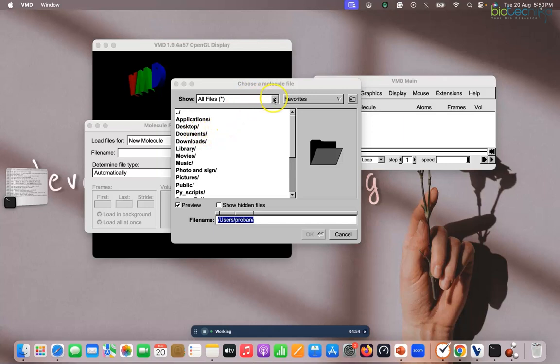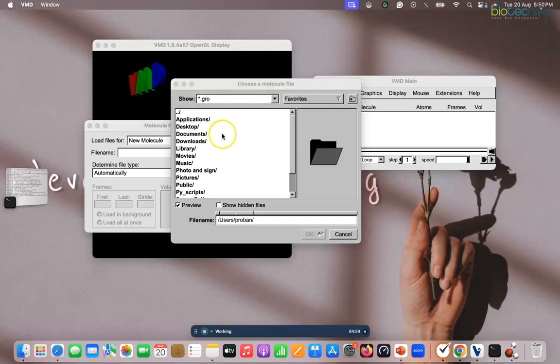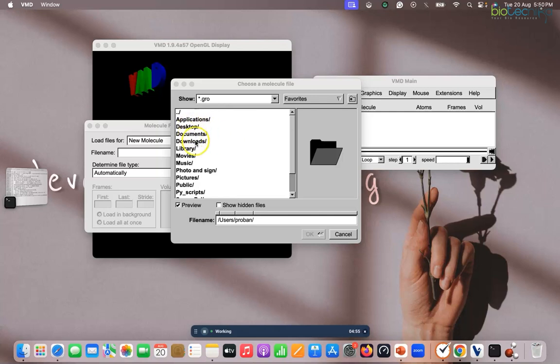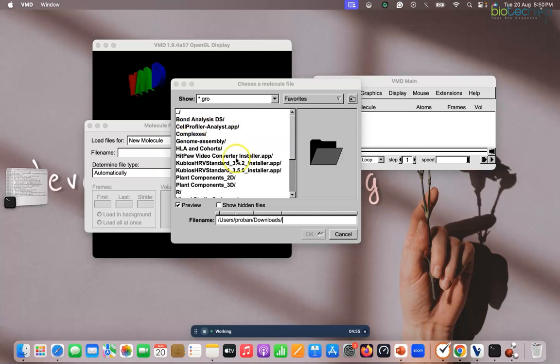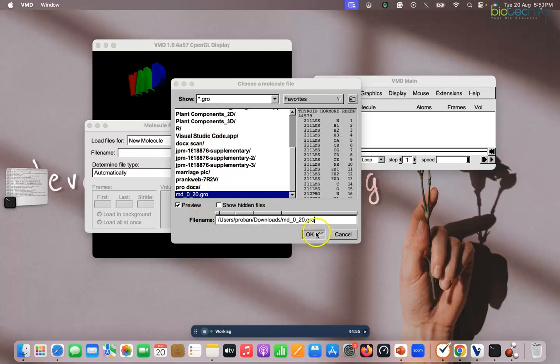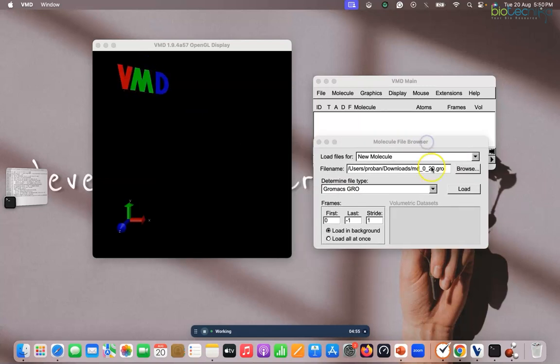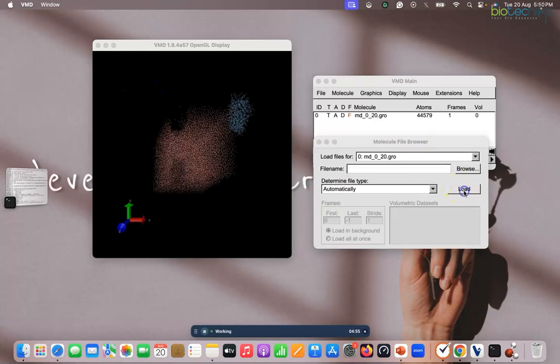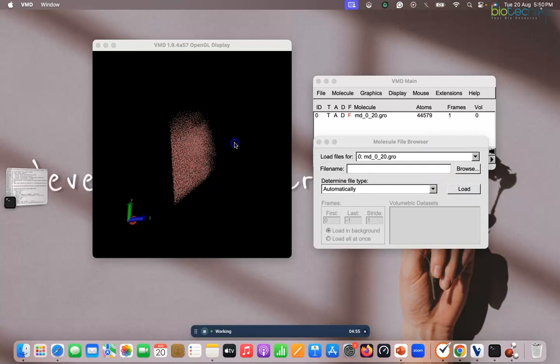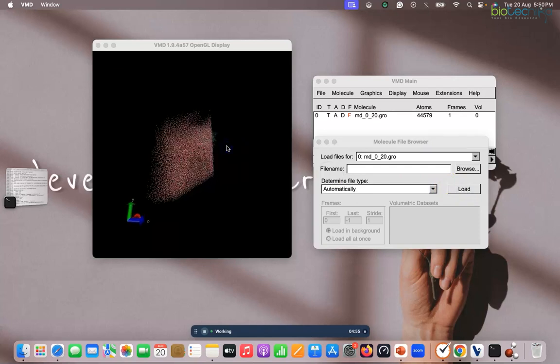And locate that particular file, or there is another way you can do the custom filter. So the first folder that we will be having will be your .gro file because it is from GROMACS. So okay, if I hit on okay, then if I go to your I have it in downloads, so in downloads this is the file. If I click on this file, if I hit okay.